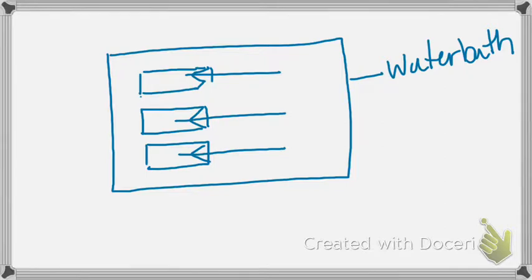And then after that period of time, you do not want to touch these respirometers at all. It's very sensitive. Any waves in your water bath are going to definitely have an impact, because pressure certainly is an important thing. So be very, very, very careful. Now, when you are doing this, I want you to have a control in each water bath. You need a control for every water bath that you've got, because the temperature changes in one water bath might not be the exact same as in another, so they each need their own control if you have more than one water bath.